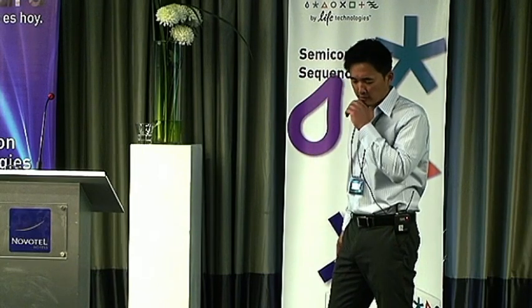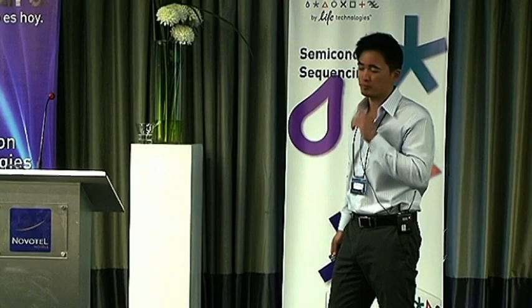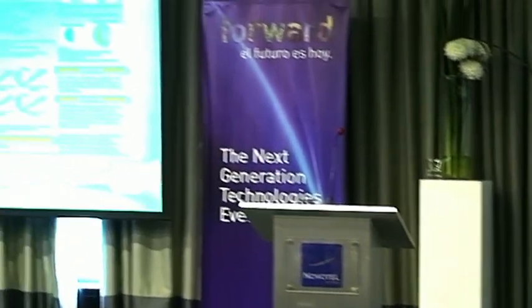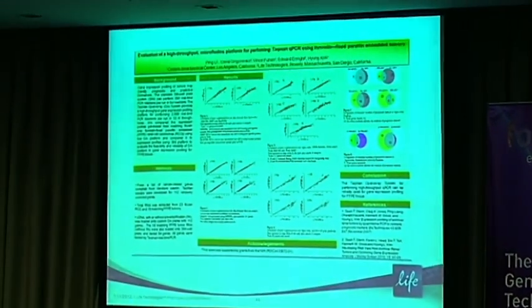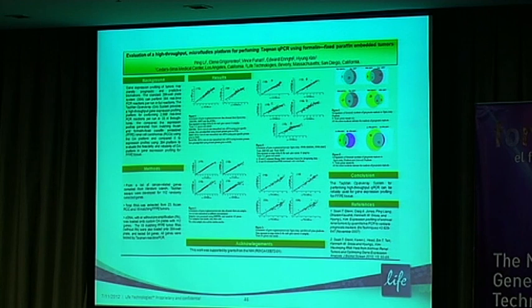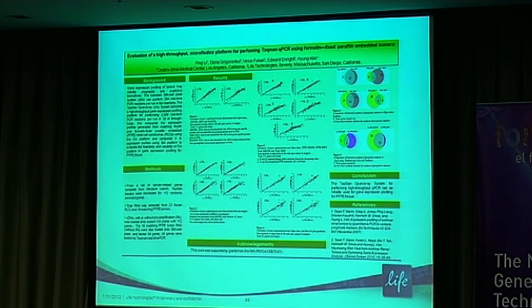This poster, although small, you can pretty much look at the middle and figure out what the message here is. It's correlation analysis, correlation plots, very high R-squared values. This is a group that I work with at Cedars-Sinai Medical Center in Los Angeles. The reason they included me on this poster as an author, and they'll be publishing later this year as well, and the reason why I like showing this poster is because they were skeptics of this preamplification method.